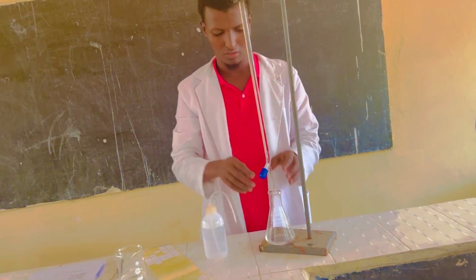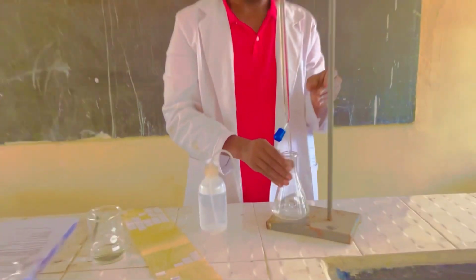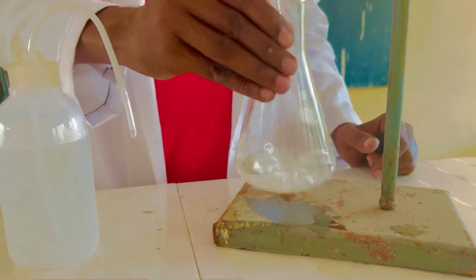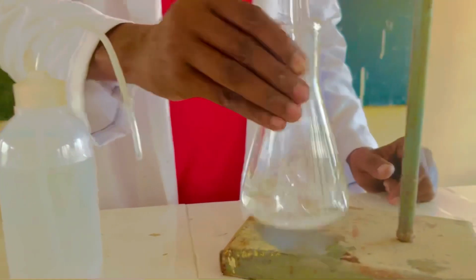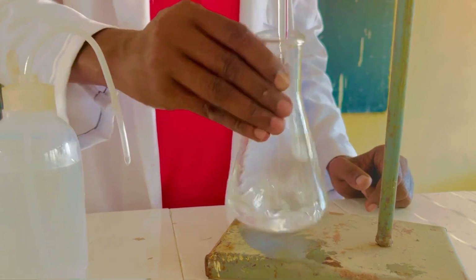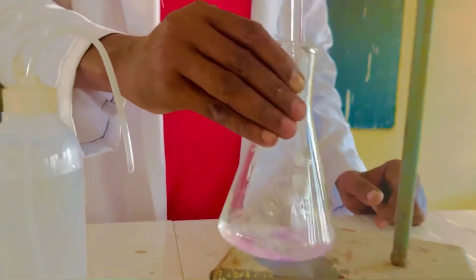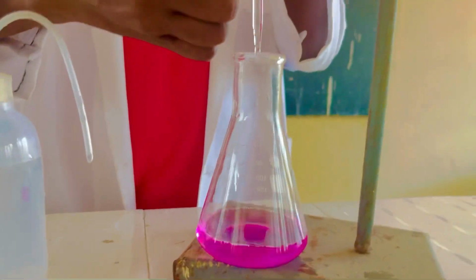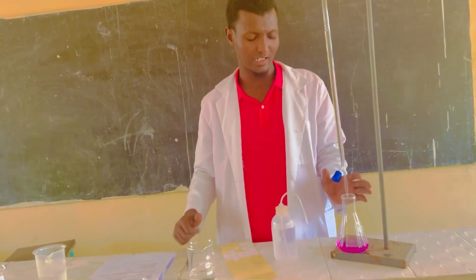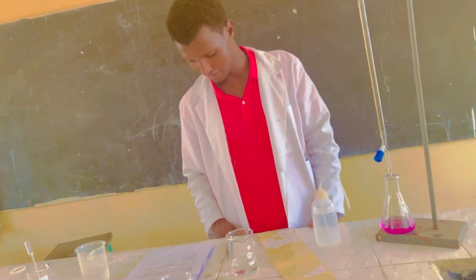Now I'm going to do my titration. So this is what titration means. I'm doing titration now. Good. I was titrating until I saw a color change. That is a pink color because I've added a phenolphthalein indicator.